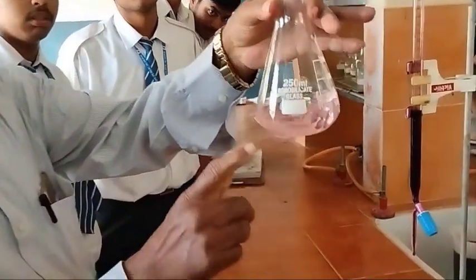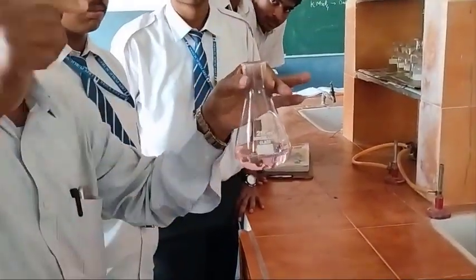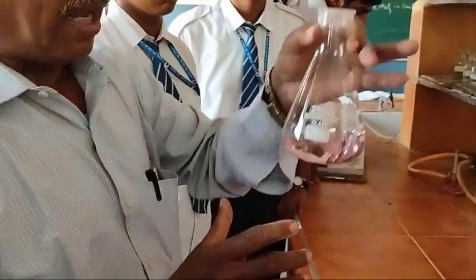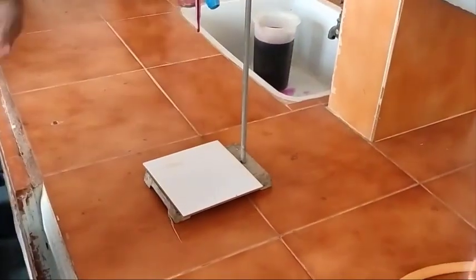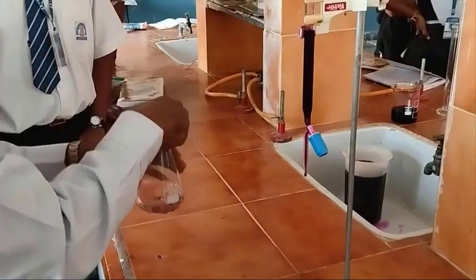Now, see, pink tinges are observable. The color should be still lighter. That is the end point. We call this the end point. End point means completion of the reaction. To confirm, just stir it thoroughly. Now the color is not disappearing. That means the reaction is completed.